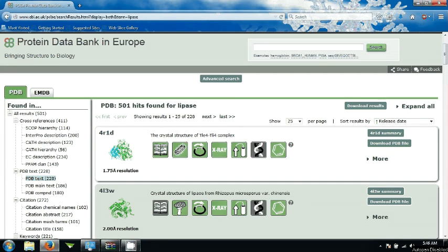Hello everyone, today we are going to perform the practical of Dr. Zahid, which is protein docking.